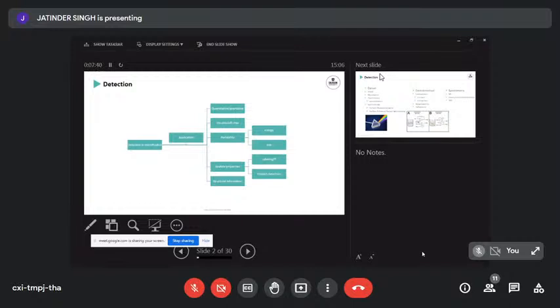So you know your analyte, which then means that it may not be as critical to have structural information coming out of your detector signal. So detection, again, there's a lot of choices. A lot of the decision making will depend on what you want to measure, where you want to measure it, and then what skill do you have.